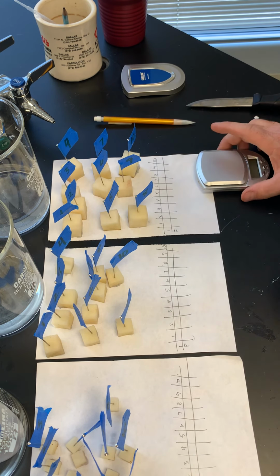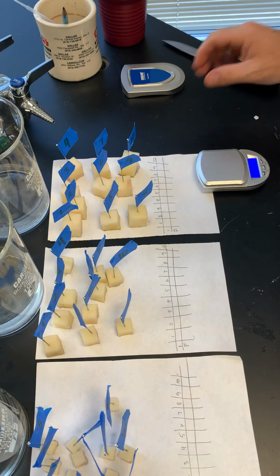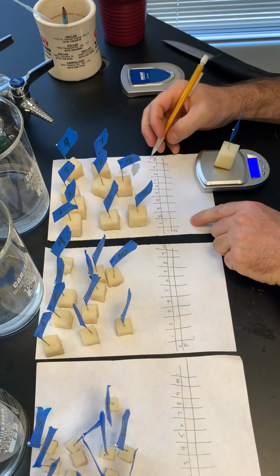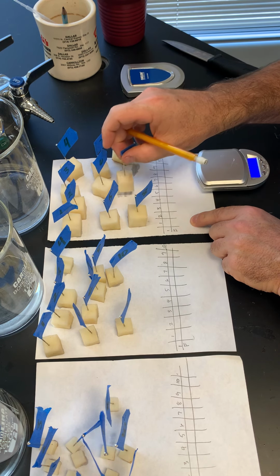So first things first, I'm going to write all this down. I'll start with my large group. I'm going to do 10 first. 15.2. So this is my initial column. This will be my final column. 15.2. Put it back. Get 9.